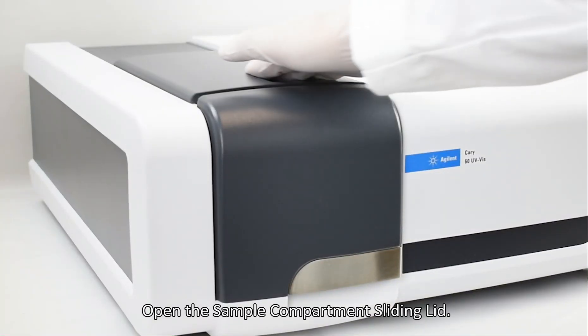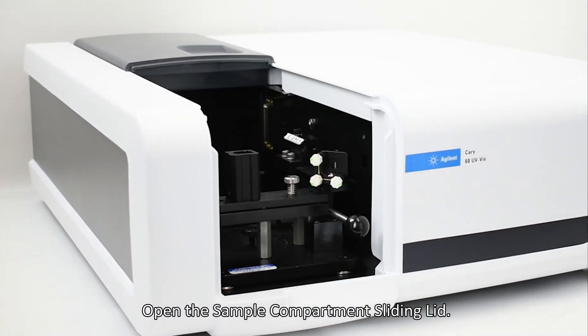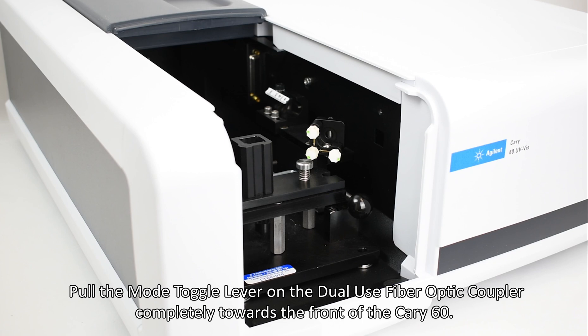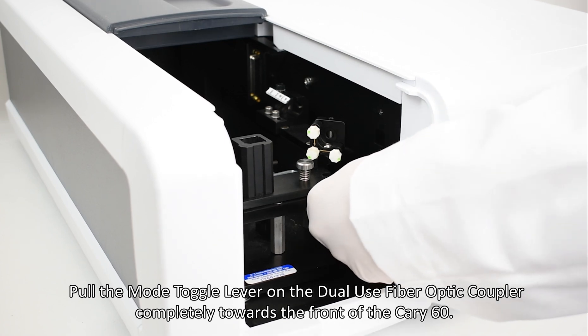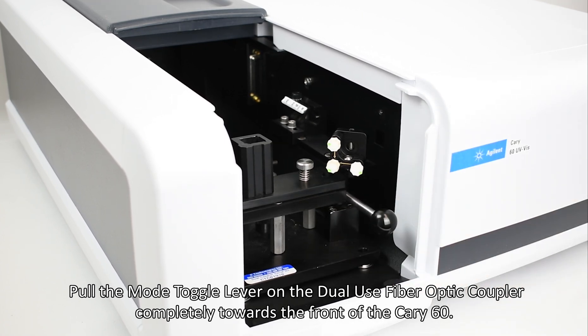Open the sample compartment sliding lid. Pull the mode toggle lever on the dual-use fiber optic coupler completely towards the front of the Cary 60.